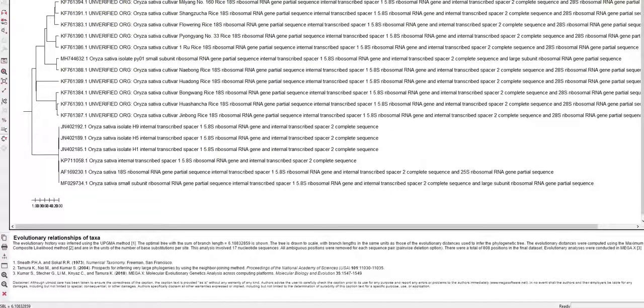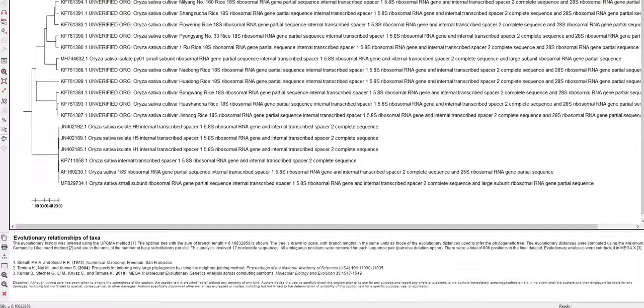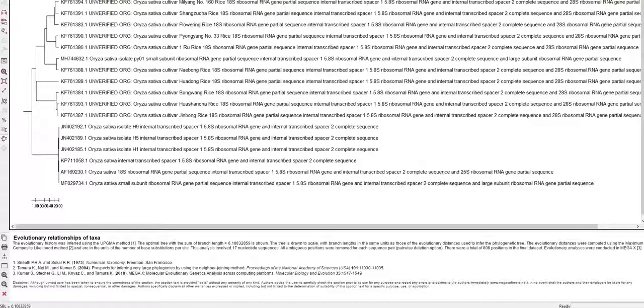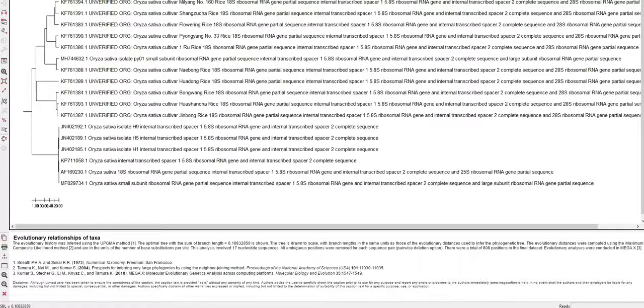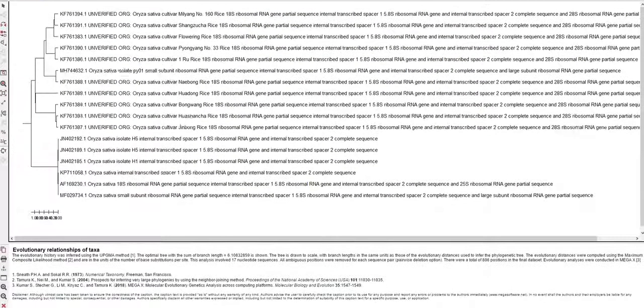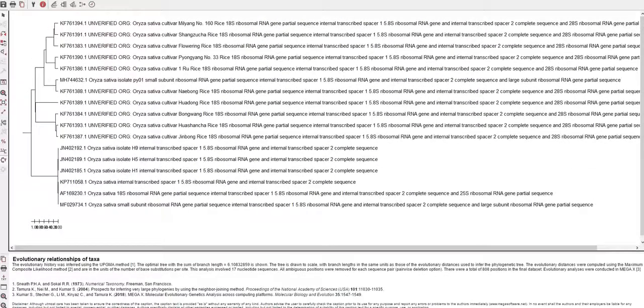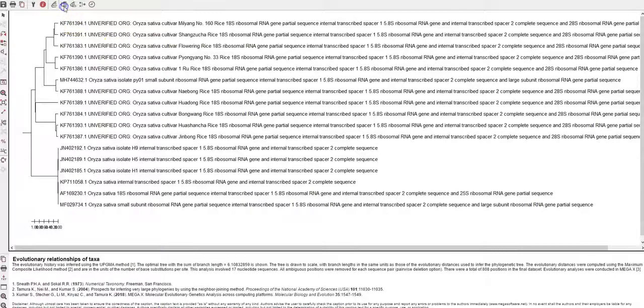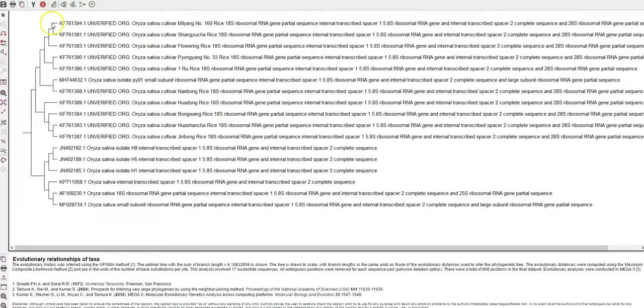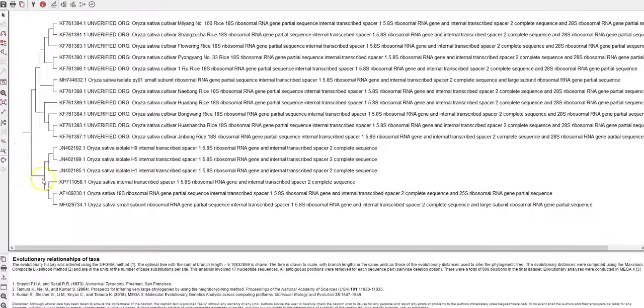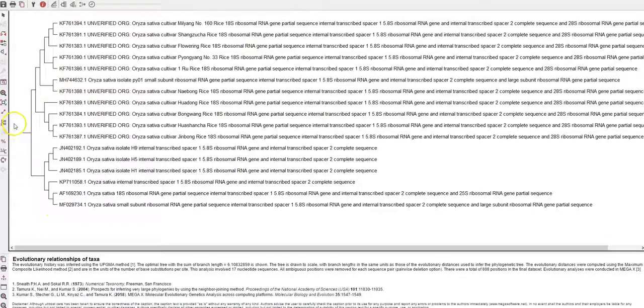And you can construct multiple trees using the NJ or the UPGMA algorithms. So this is a basic explanation of the MEGA software and you can utilize these functions to look at the branch lengths and analyze them in detail. Thank you.